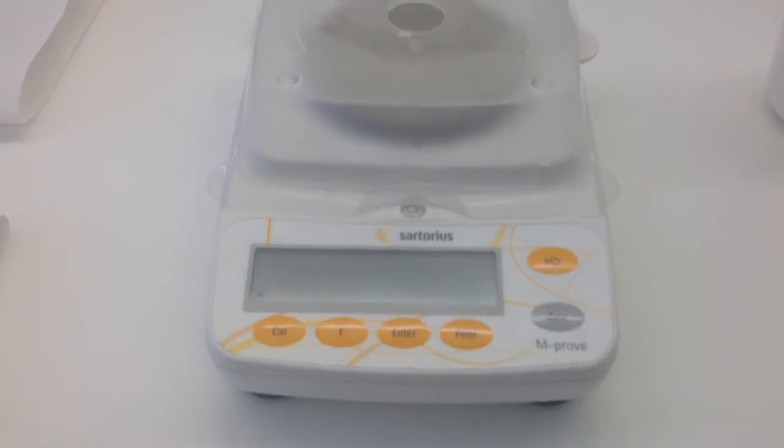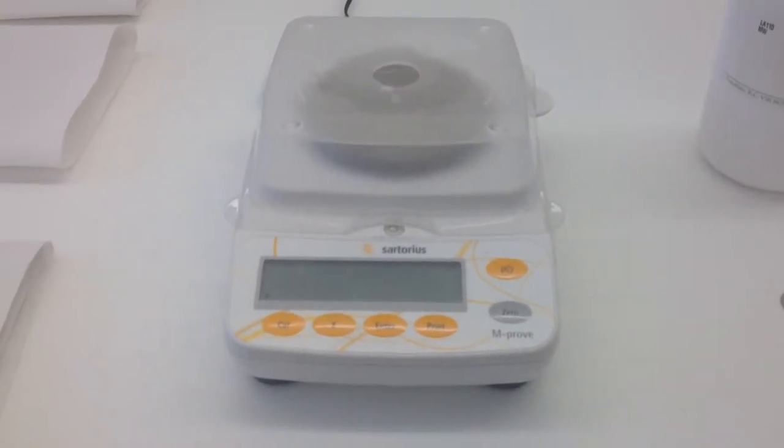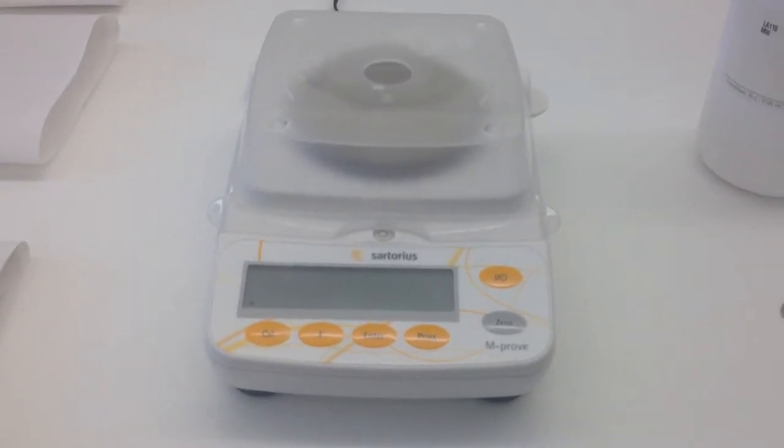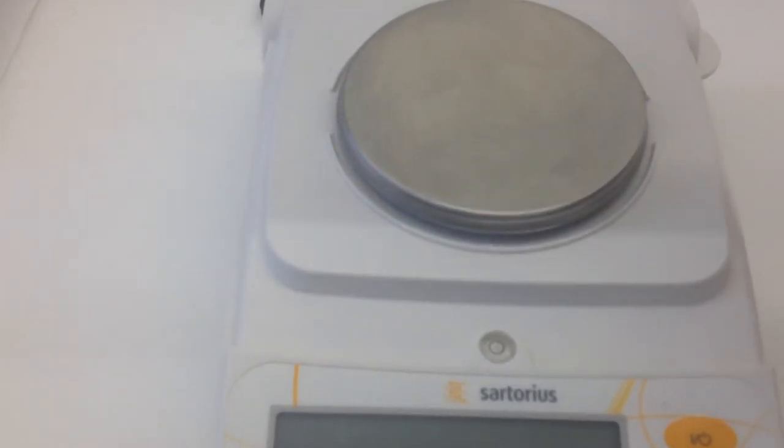Our balance is just here on the table. We always want to make sure when we're using any of the balances in the lab that they're placed on a secure, level surface. Unfortunately some surfaces look level but they aren't always going to be level, and the way that you can tell that is by using the leveling bubble that's on the center of the balance.